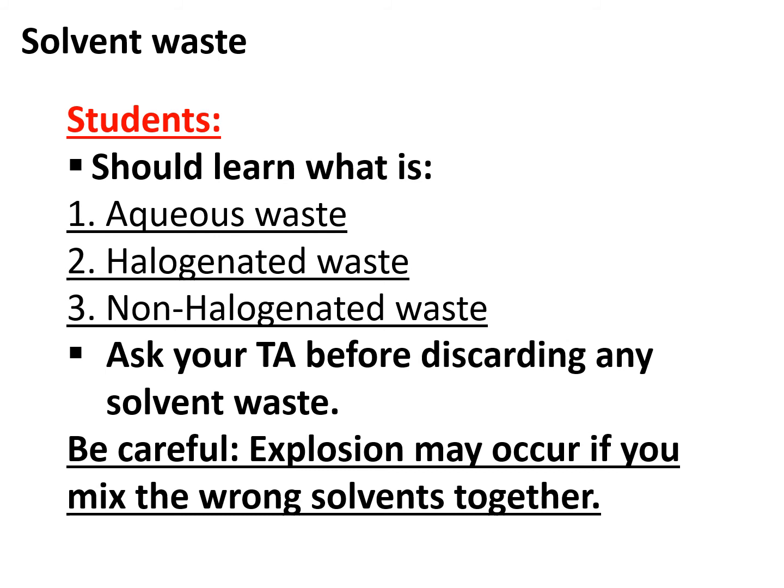Non-halogenated waste is just like it says, anything that's organic that doesn't have a halogen in it. So that's, of course, going to be your biggest, most used waste container for an organic lab.